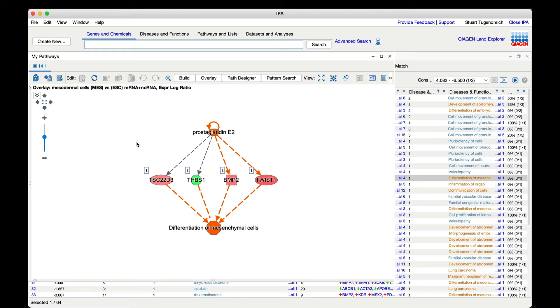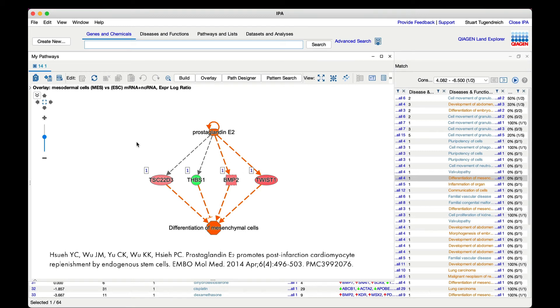This inference is made more plausible by the existence of a paper entitled prostaglandin E2 promotes post infarction cardiomyocyte replenishment by endogenous stem cells which shows that this compound can indeed act on stem cells to generate cardiomyocytes and this paper was not used in the creation of this network by IPA.